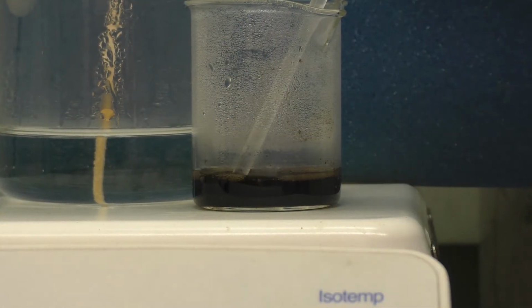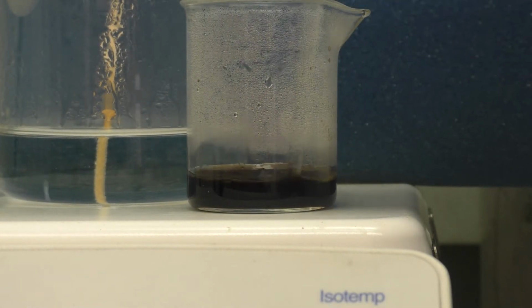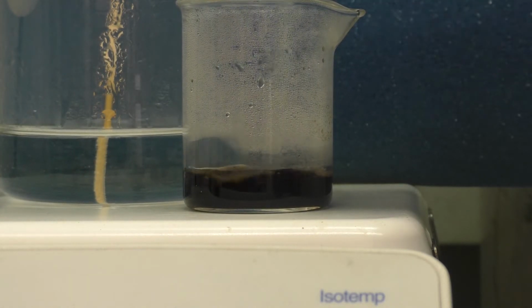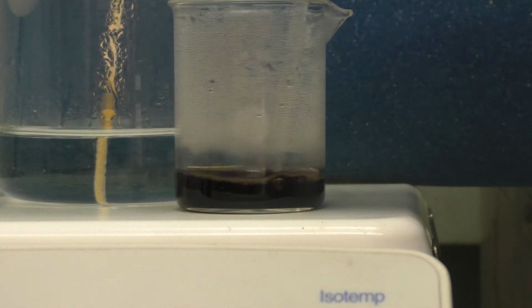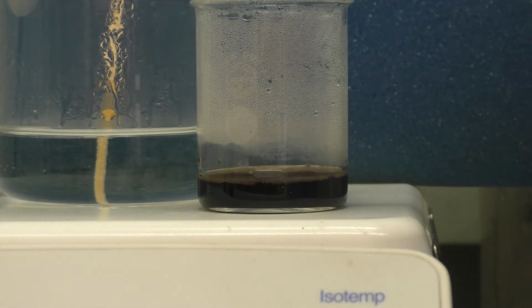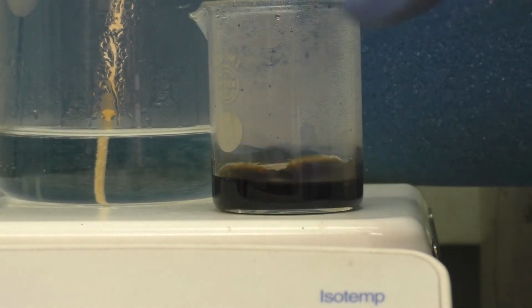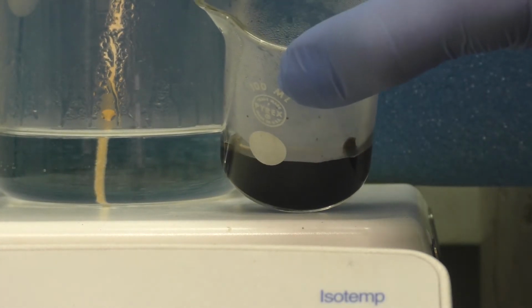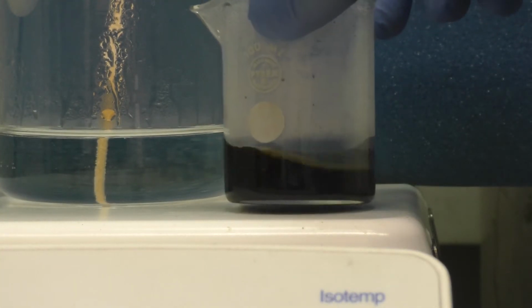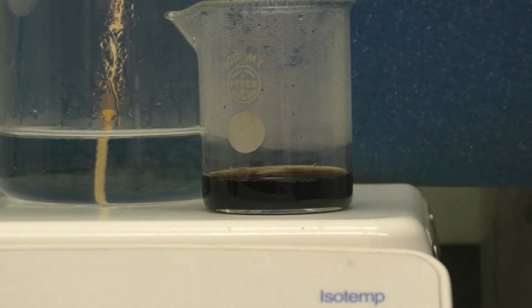My solution is very dark. It seems to perhaps have more colored impurities even after some of the reaction. My acetaminophen seems to have darkened some. Now I've got this solution boiling. It does appear, although it's very dark, as if all of the solid material has dissolved.